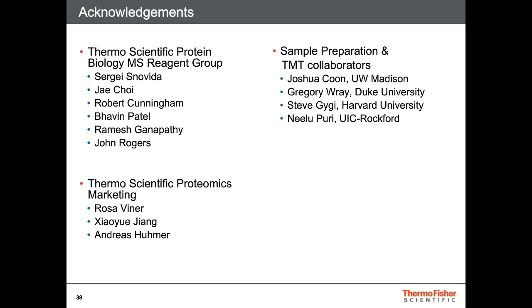So basically, what I see is that there are a lot of homebrew protocols that people within the lab are highly familiar with and have optimized. But when new users are trying to do mass spec sample preparation, they sometimes don't necessarily understand all of the reagents that are in the workflow, and some of the concentrations that they use are excessive, and that leads to poor results downstream.